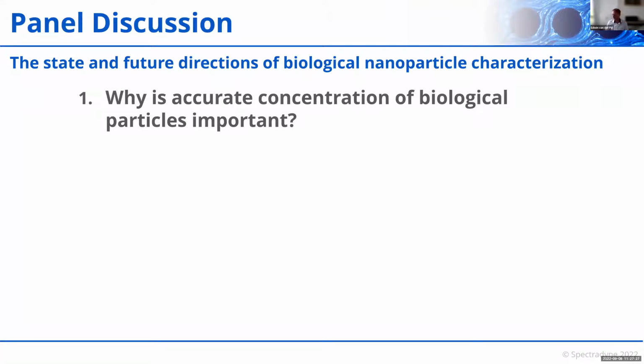And yeah, I happen to work with metrologists, and they actually shiver a bit from the question, could you please determine the concentration of these nanoparticles? So that I think shows that determining the concentration in an accurate way, a way where you preferably just know the uncertainty of the measurement, is very difficult.